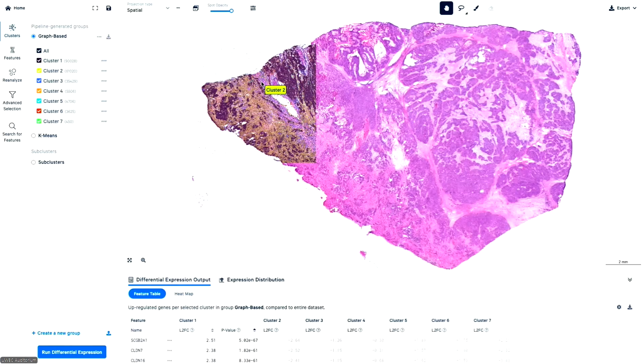Yes, for Flex, the vast majority of material that you get at the end of the sample prep is a nucleus suspension.